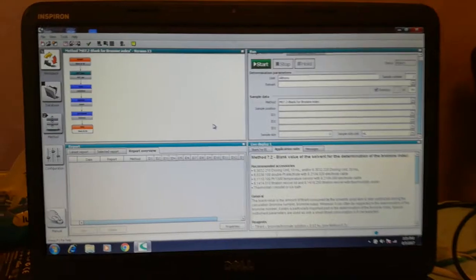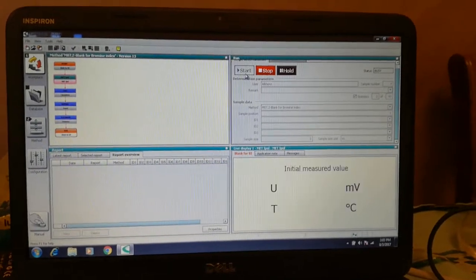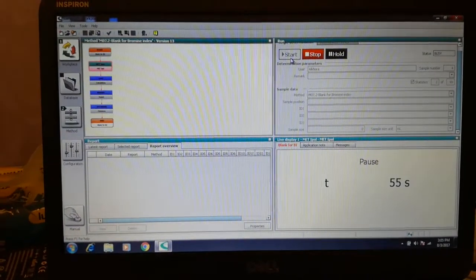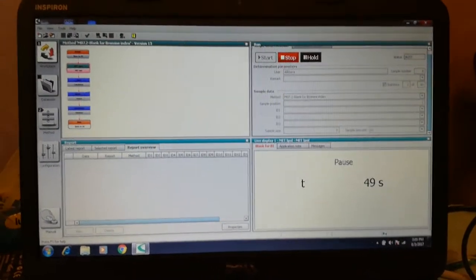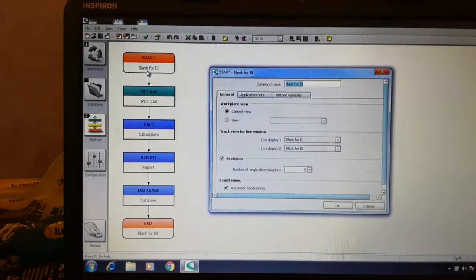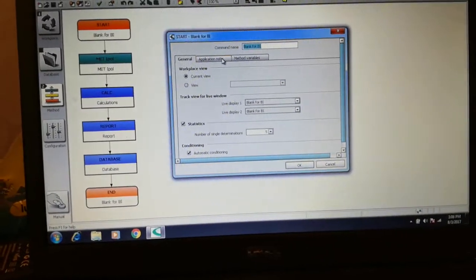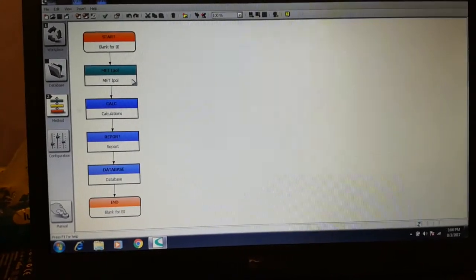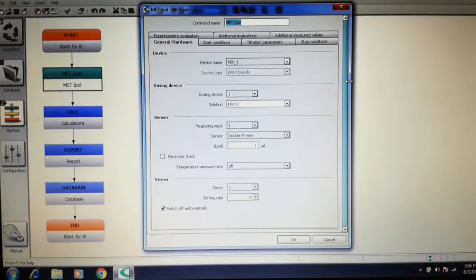Fill the cylinder with the solvent and pour it into the mixing flask, then let it cool down. Press the start button and wait until you get the chart. Meanwhile, let's check out the settings of the method — this is the blank for bromine index. These are the settings in the tabs.